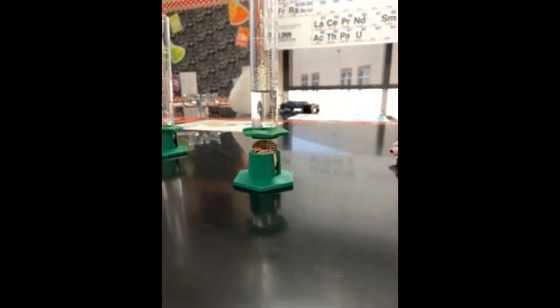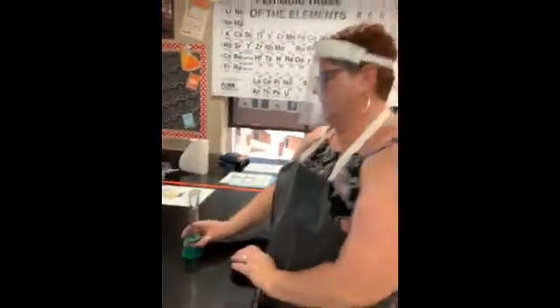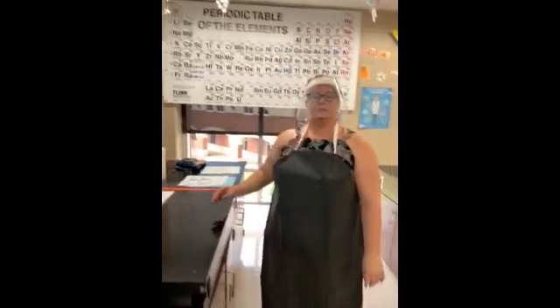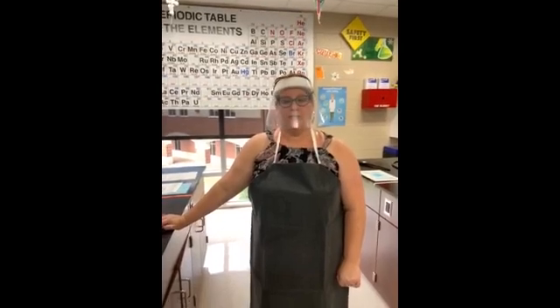Please make a note that every time I'm reading these, I'm coming down. I'm not moving the graduated cylinder. It's staying on the table, and I bring my eye down to read the volume of the liquid. That's your data collection. Your analysis will take place in class, and your teacher will give you more directions on that. You guys have a good day.